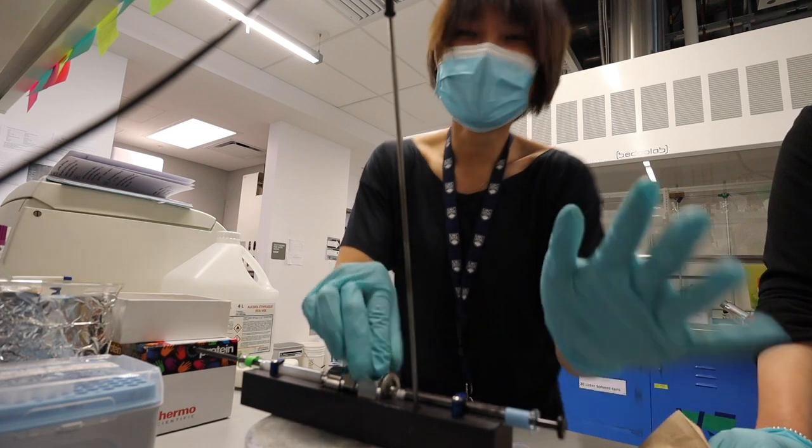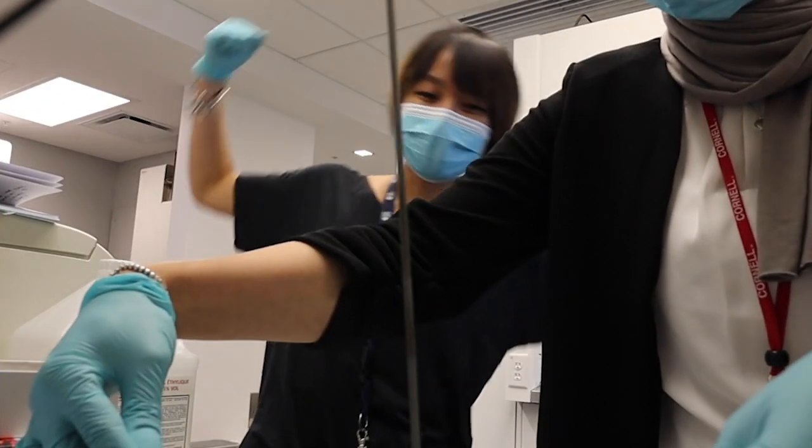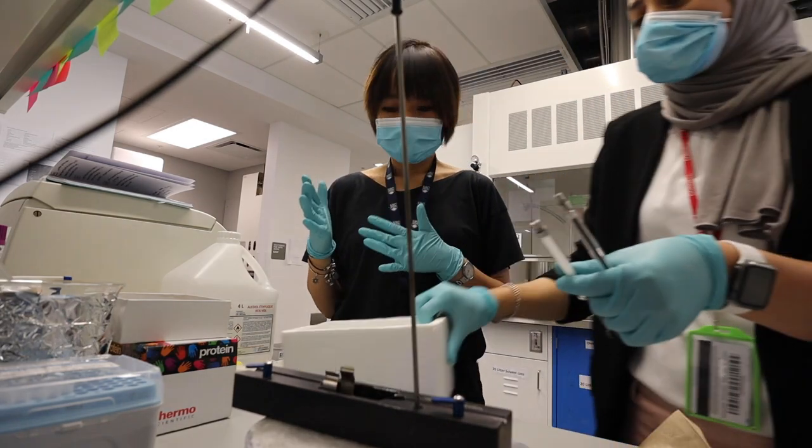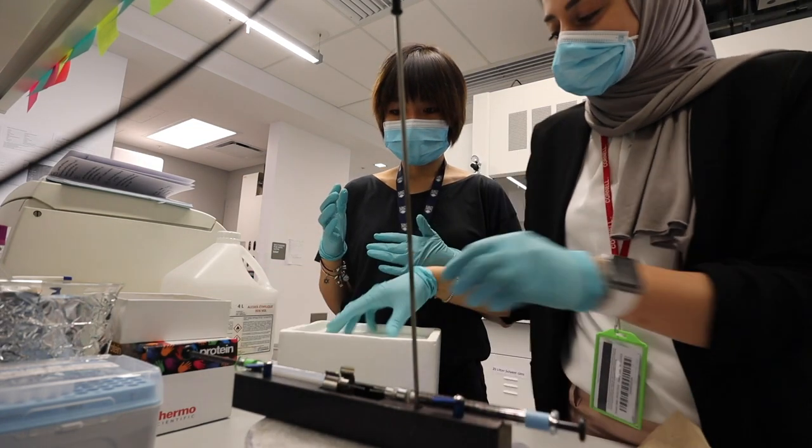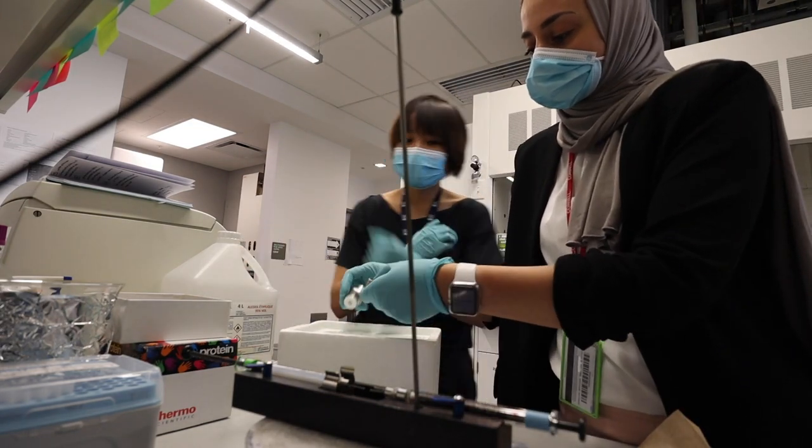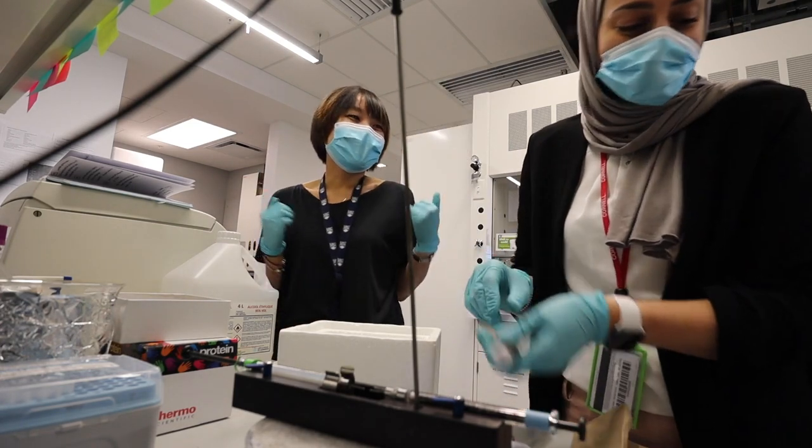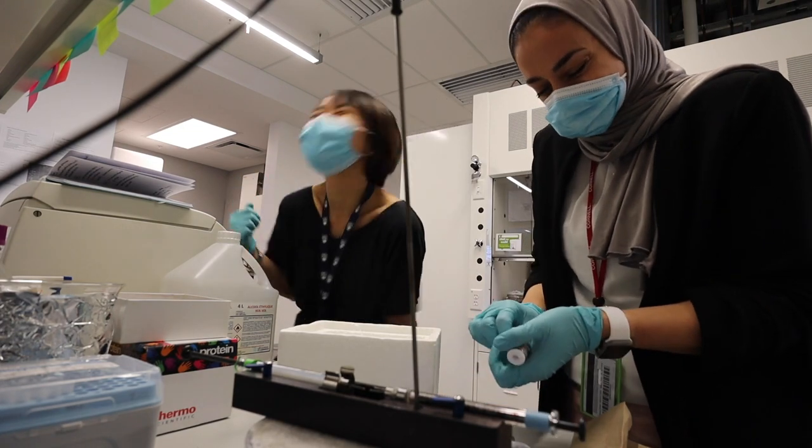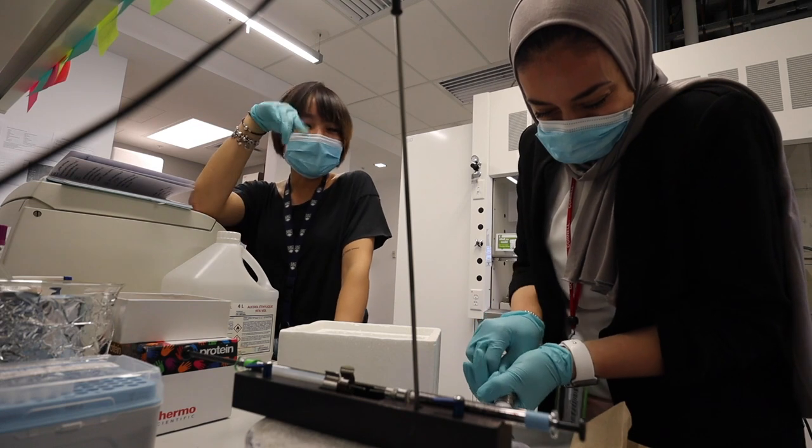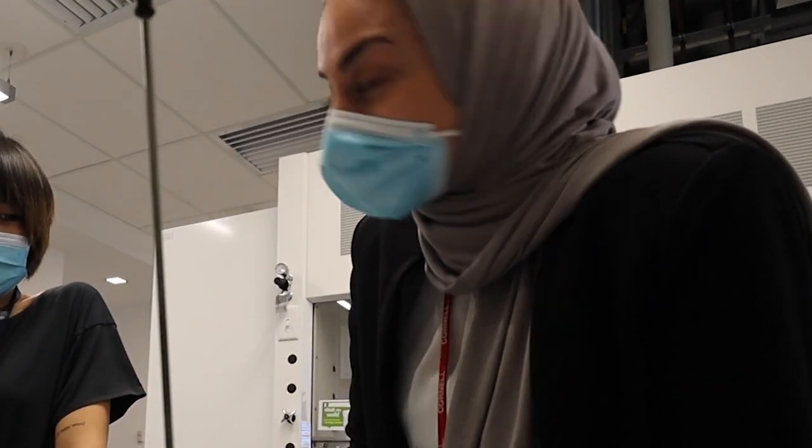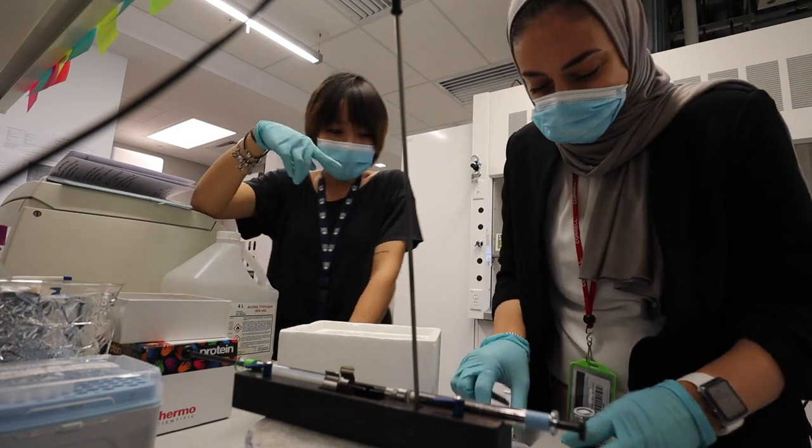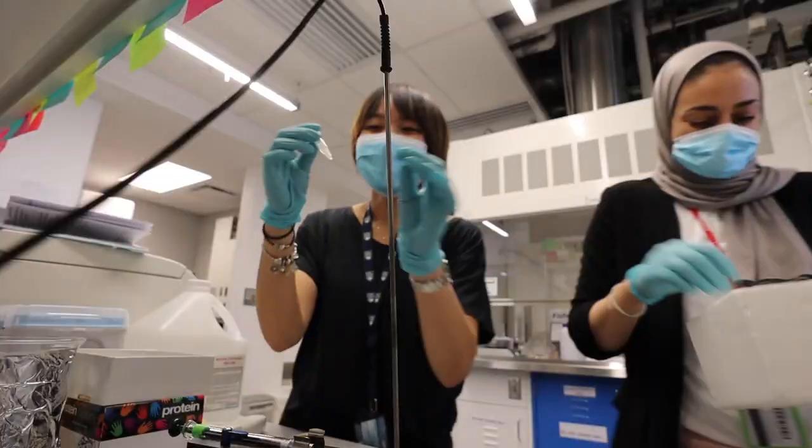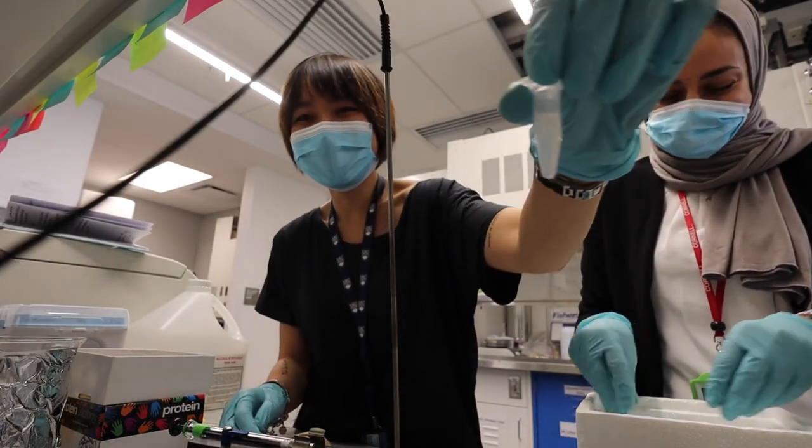Good job. I feel the sweat. Okay, because this is too hot I'll just put it in ice so I can open it. All nanoparticle people should have really big arms, you know? Really jacked biceps. I feel it in my shoulders. This is round one, round one of three. No, round one for this one, and then seven more times after.